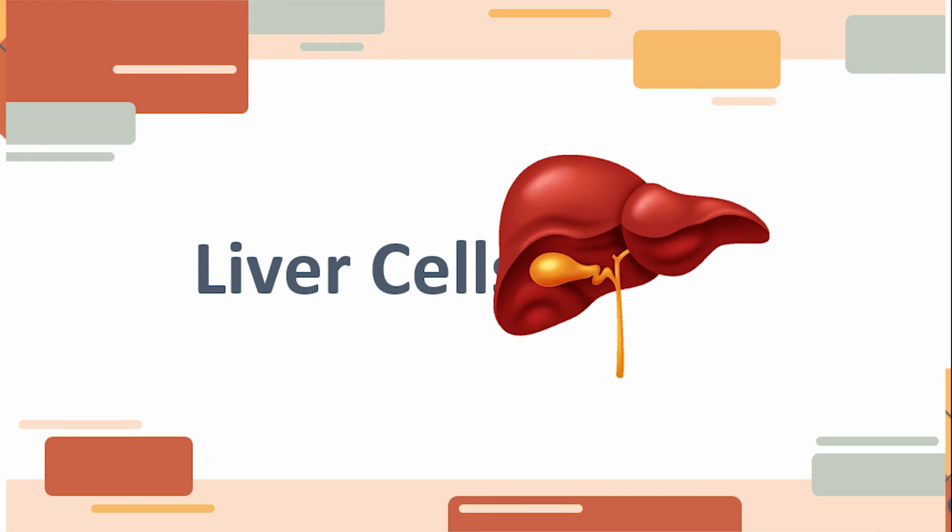So, next we move to the cytology of the liver. Any study of the cellular composition of fine needle aspirates from the liver requires an understanding of the liver structure. In brief, the liver consists of small hexagonal lobules, each with a central vein. The liver cells, hepatocytes, are arranged in thin sheets which radiate from the central vein to the periphery of the lobule and are separated by sinusoids lined with endothelial cells and phagocytic Kupffer cells.